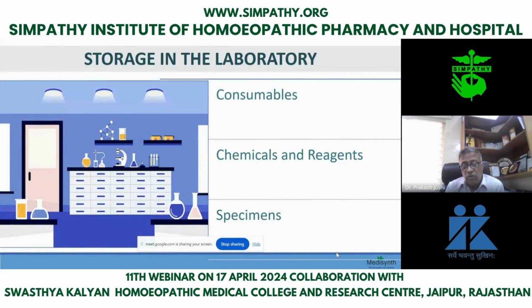Chemicals and reagents, you all know that. Secondly, whatever chemicals and reagents we are using should be analytical grade. There are also laboratory grade chemicals. When you buy a chemical, it is mentioned whether it is AR, LR, or GR. So for HPLC, there are different grade chemicals.